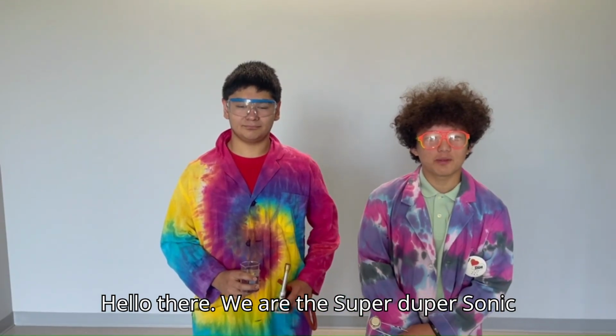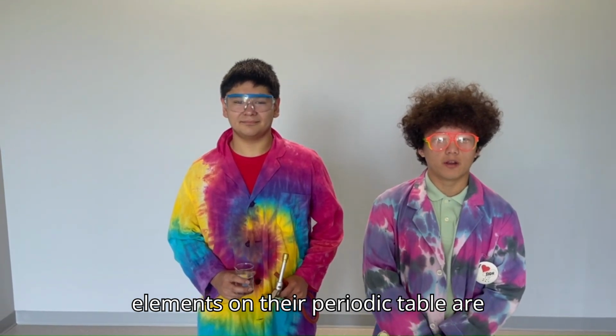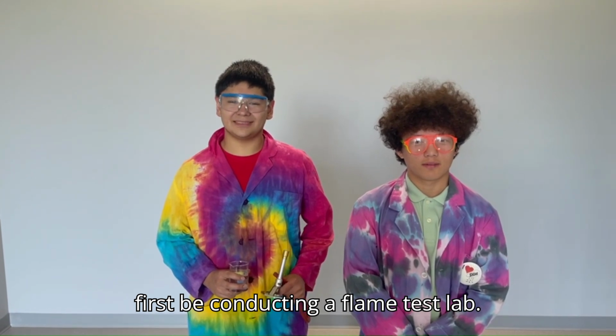Hello there, we are the Super Duper Sonic Chemists, and we'll be teaching you about how elements on their periodic table are individually unique. To show this, we'll first be conducting a flame test lab.